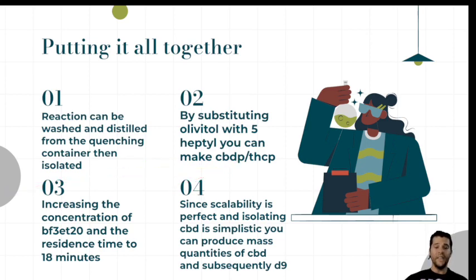But anyway, this is the secret sauce for literally flow-through producing basically any high caliber cannabinoid on the market right now. It can be done by simply using flow process, flow chemistry, flow batch reactor size, and just taking your subsequent starting resorcinol. For CBD, that would be olivetol. I already gave you another one, which is 5-heptyl resorcinol.